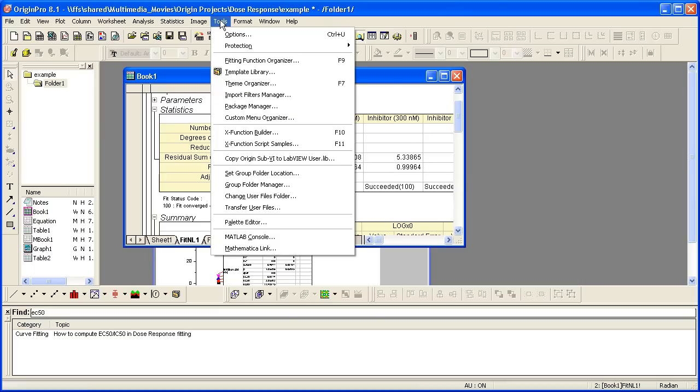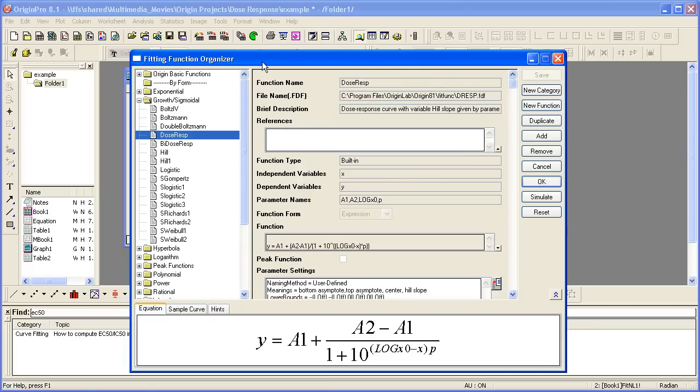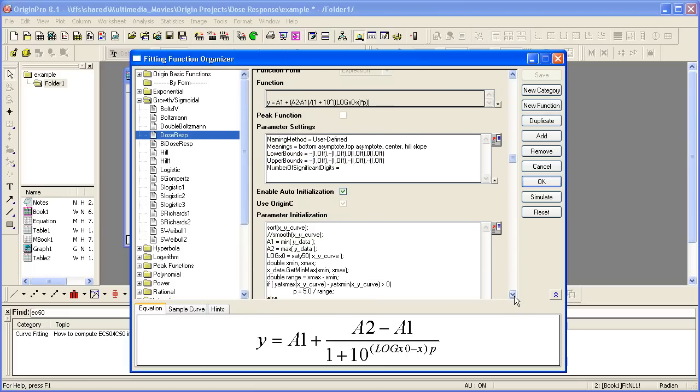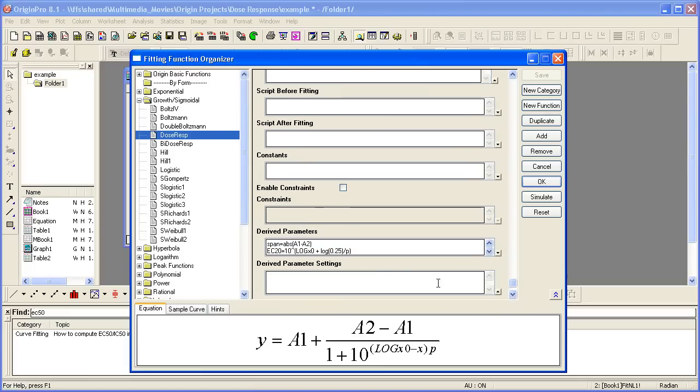We're then going to open up the Fitting Function Organizer. I select the function from the list on the left, and this is where I can edit the function itself. Scrolling down, I'm going to get to the derived parameters list.